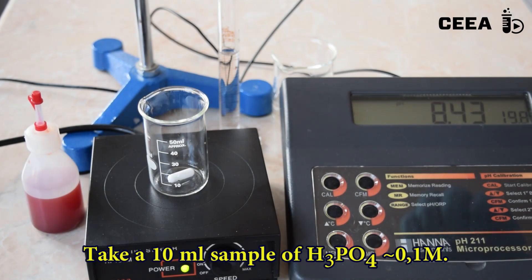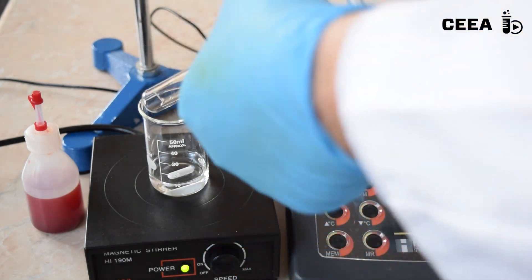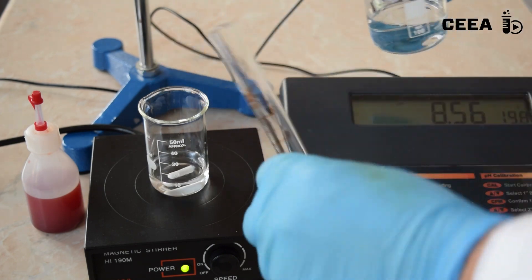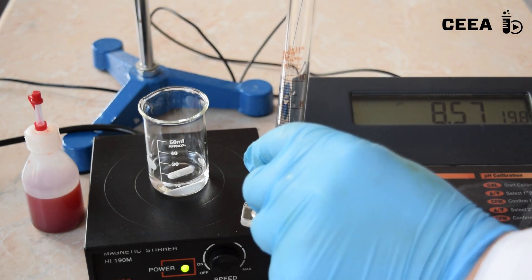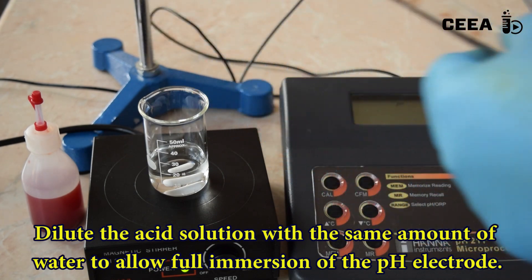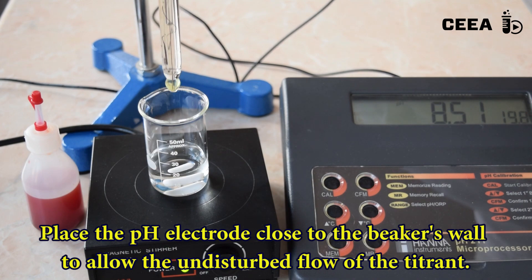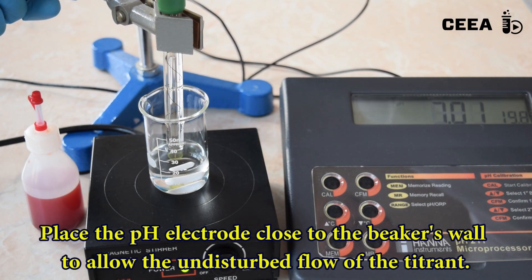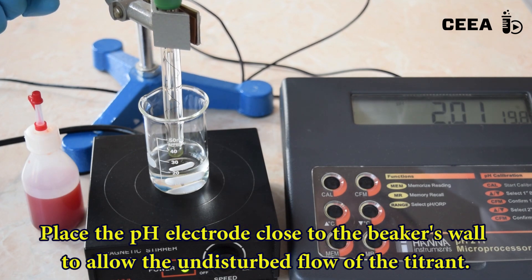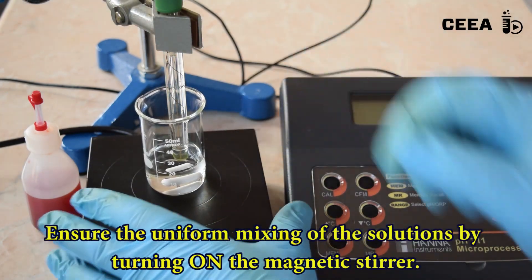To do the experiment, pour 10 milliliters of 0.1 molar phosphoric acid into a 50 milliliter beaker. Add the same amount of water to be able to immerse the pH electrode in the solution. Place the pH electrode close to the beaker's wall. Turn on the magnetic stirrer.